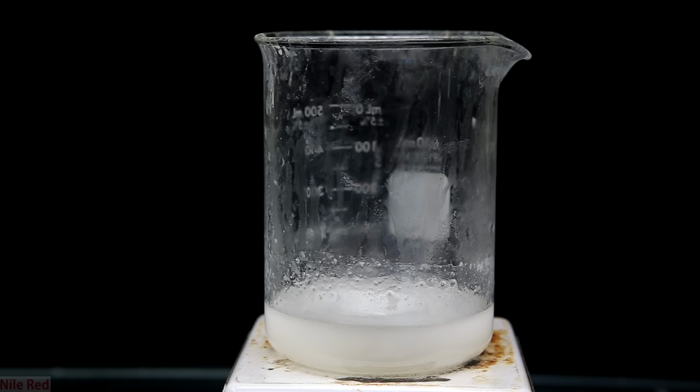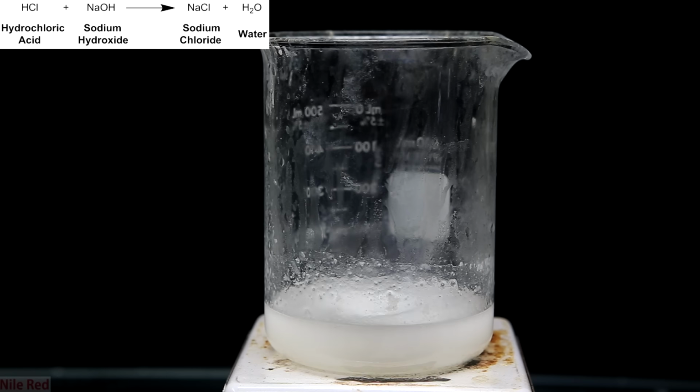What's happening here is actually several different separate reactions. Like I said before, we do have an acid-base reaction going on between the hydrochloric acid and the sodium hydroxide. This will be the major reaction that occurs because until all the sodium hydroxide is consumed, we won't have any hydrochloric acid to take part in the other reactions. Once the sodium hydroxide is being consumed, we start using the hydrochloric acid in two other separate reactions.